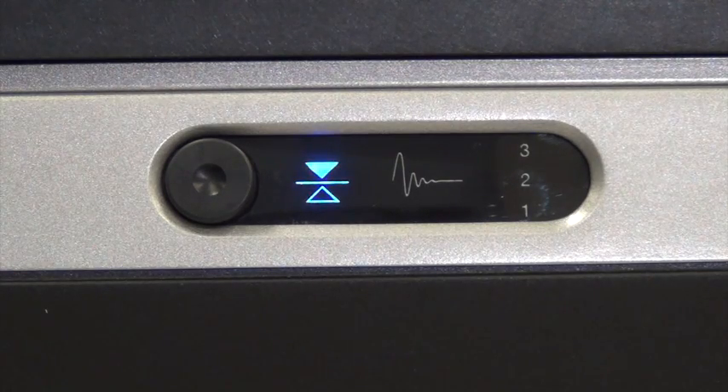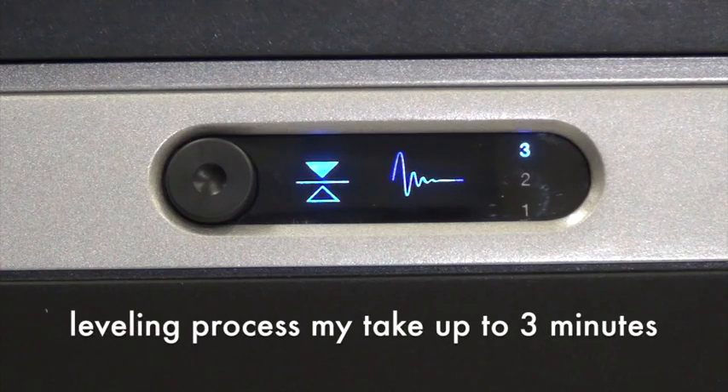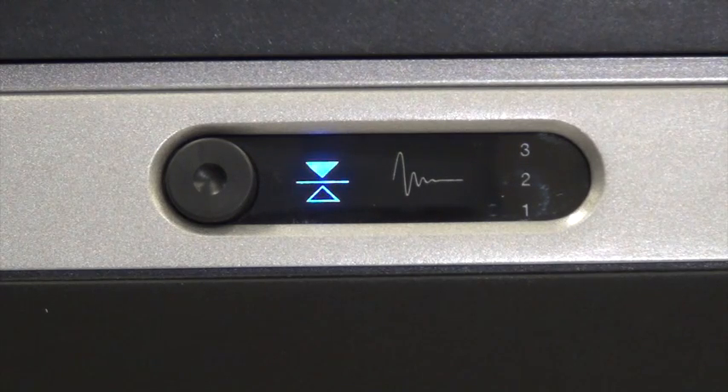The system automatically levels the top plate when the level indicator flashes. Once the top plate is level, the indicator changes from flashing to solid. The leveling process may take up to three minutes at initial startup. When the system is restarted with the same payload, this process may only take a few seconds.